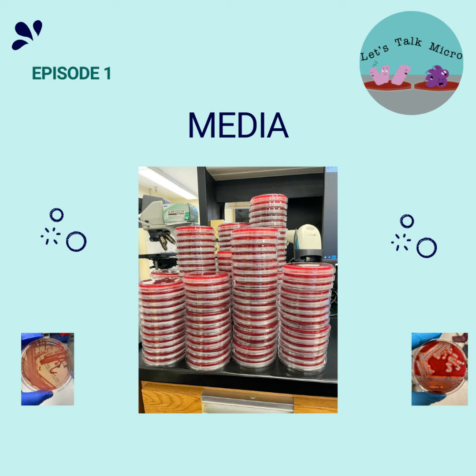And then which agar do we choose? You can have a slight variation from lab to lab, but basically they all have the same. It's from the American Society for Microbiology. They create the standards for us. So basically your standard culture has blood, chocolate, MacConkey, and then depending on the source you add extras, like Martin Lewis if it's a genital source.